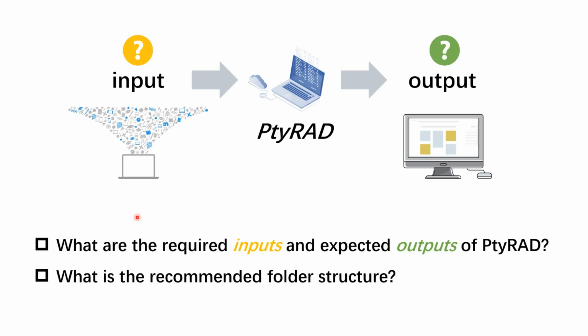Hello everyone, welcome to the introduction video on the input and output settings for PtyRAD. In this video, I'll walk you through the required inputs for running a ptychography reconstruction using PtyRAD, the expected outputs you can get, and the recommended folder structure for organizing your results.